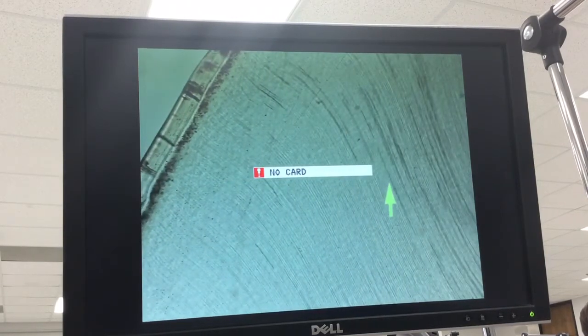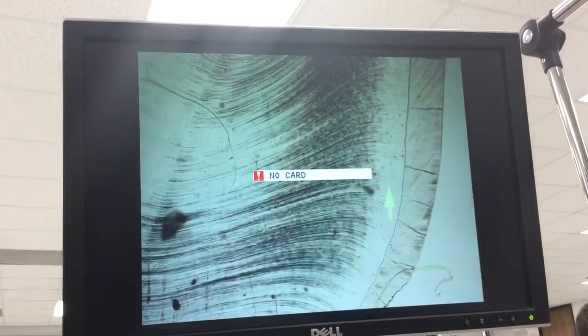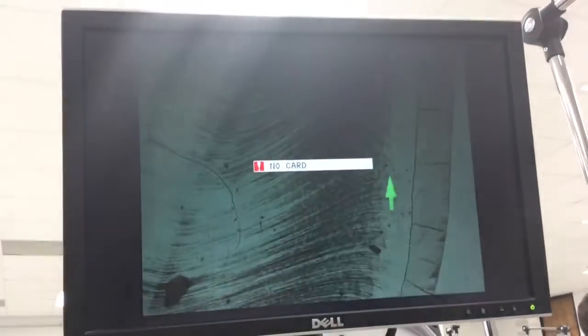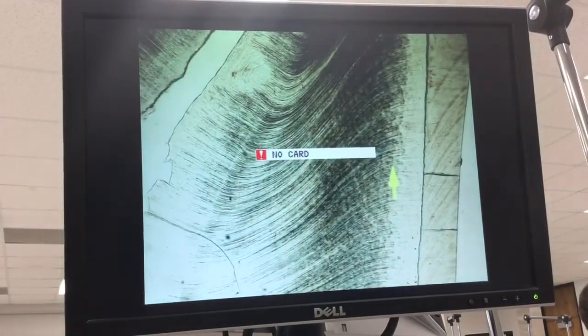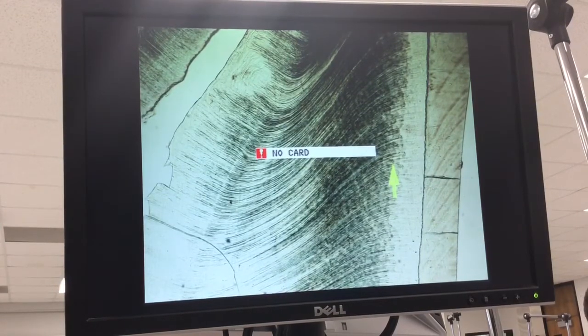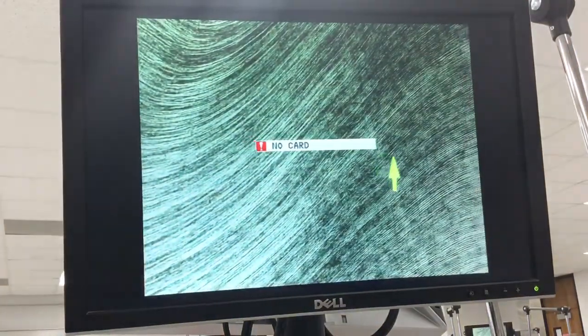And the other thing we need to find would be the interglobular dentin. And you may need to turn down the iris diaphragm a little bit. And right there, those little holly leaves that kind of almost sparkle a little bit. That is the interglobular dentin. And the concavities of those, like right in here, that's where you would find the globular dentin if you were looking at a demineralized section.